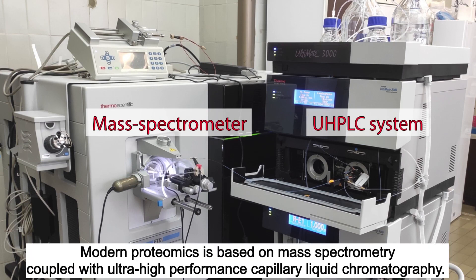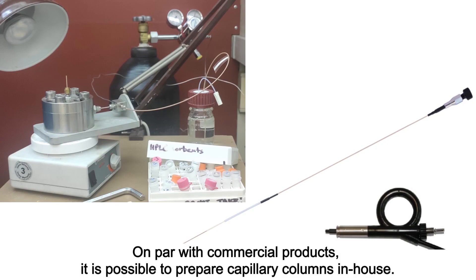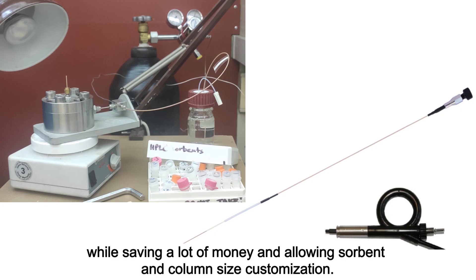Modern proteomics is based on mass spectrometry coupled with ultra-high-performance capillary liquid chromatography. Peptide separation is mostly done in capillary columns with an internal diameter of 75 µm. On par with commercial products, it is possible to prepare capillary columns in-house. Customly prepared columns demonstrate separation qualities similar to commercial analogs while saving a lot of money and allowing sorbent and column size customization.